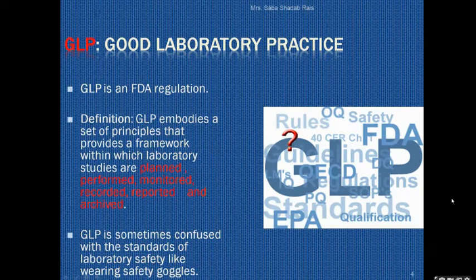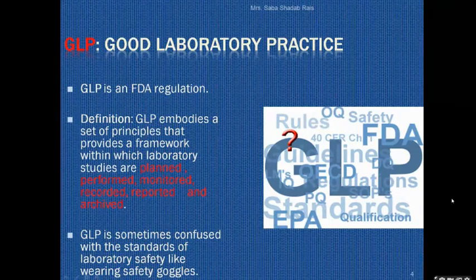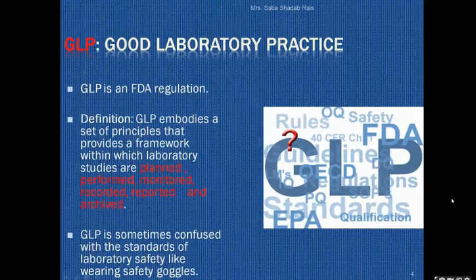They died, and because of this fraud, it led to the implementation of GLP in the US, and adherence was made compulsory for all the industries and laboratories involved in manufacturing of industrial chemicals, pharmaceuticals, veterinary drugs, pesticides, cosmetic products, food products, feed additives, etc. So it has become very, very compulsory to follow.